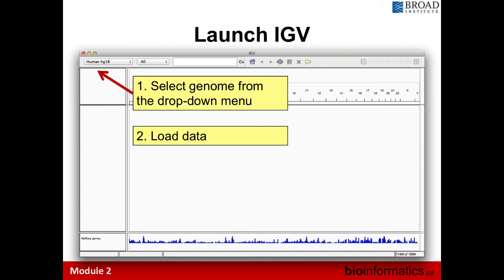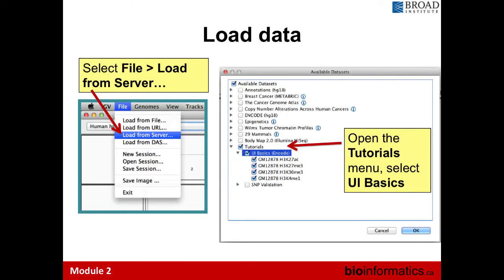Loading from a server lets you load different annotations already indexed by the Broad — Ensembl genes, UCSC genes, GC percentage, database of genomic variants — all readily available. The version you use is somewhat restricted, so keep that in mind when loading from a server; we'll get into that more in the actual lab component.